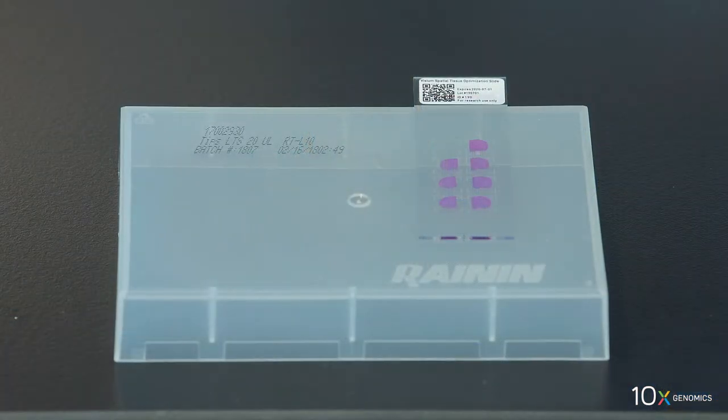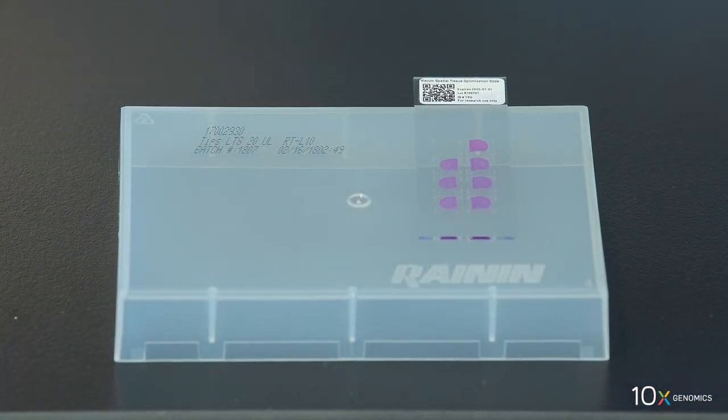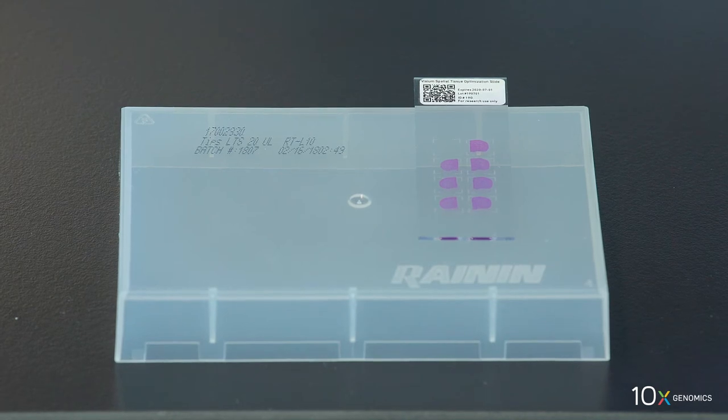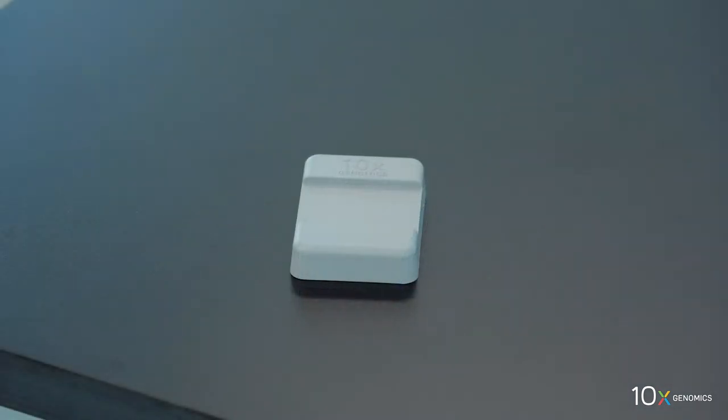We have completed tissue imaging. Now we will assemble the slide cassette. We have our Visium spatial tissue optimization slide with the fixed, stained, and imaged tissue. We have a slide cassette, a gasket, and the slide alignment tool.